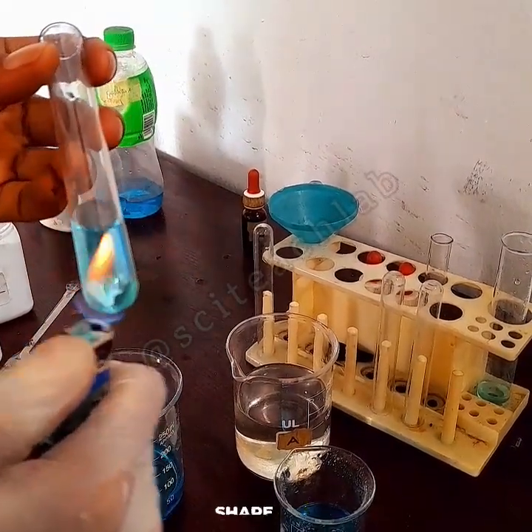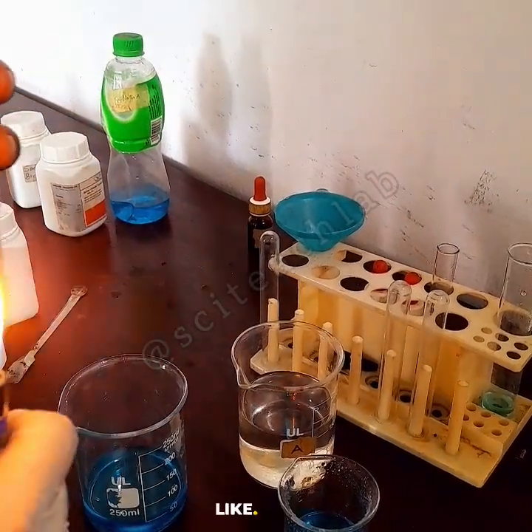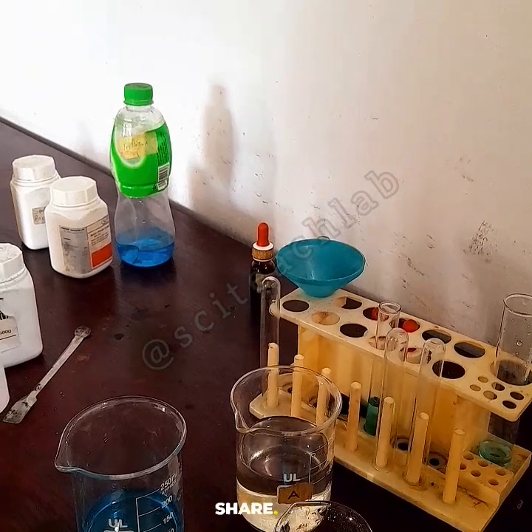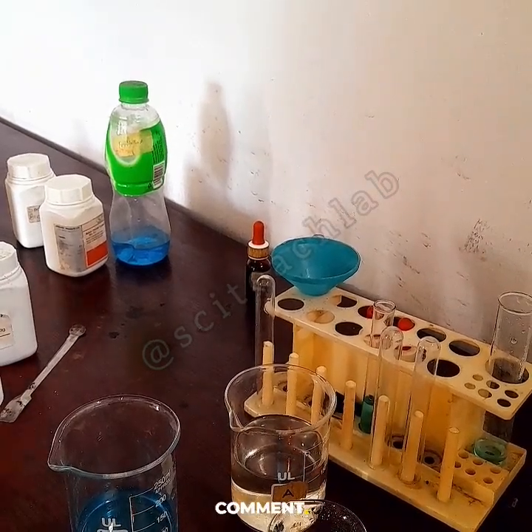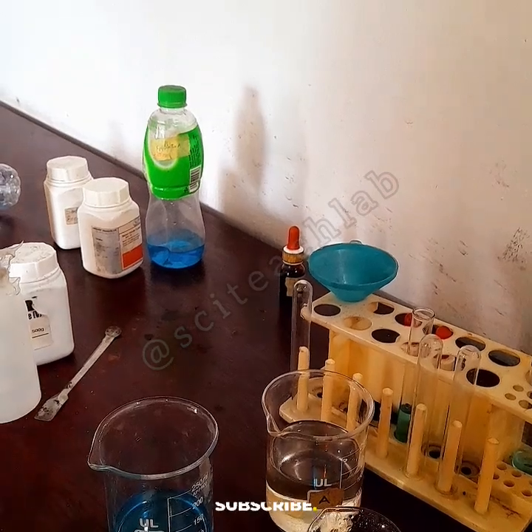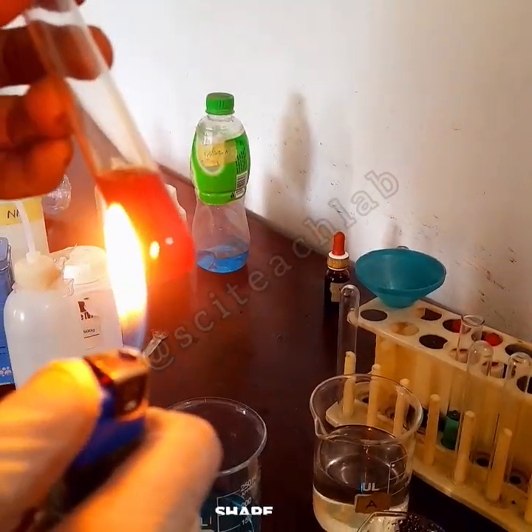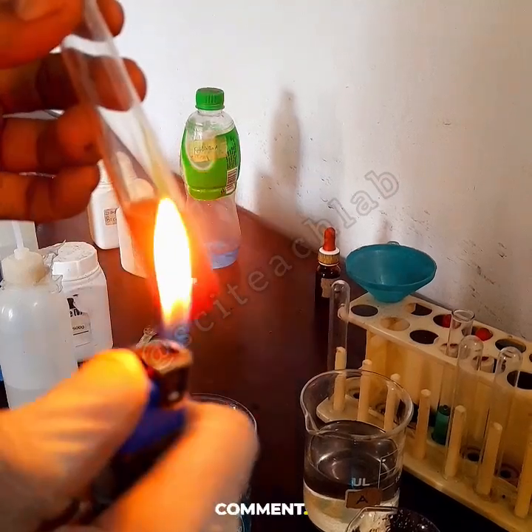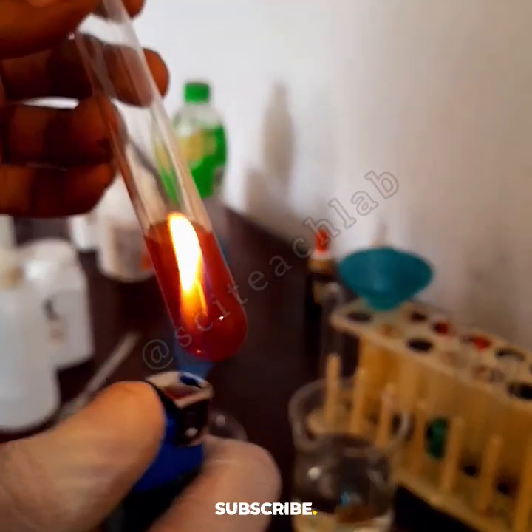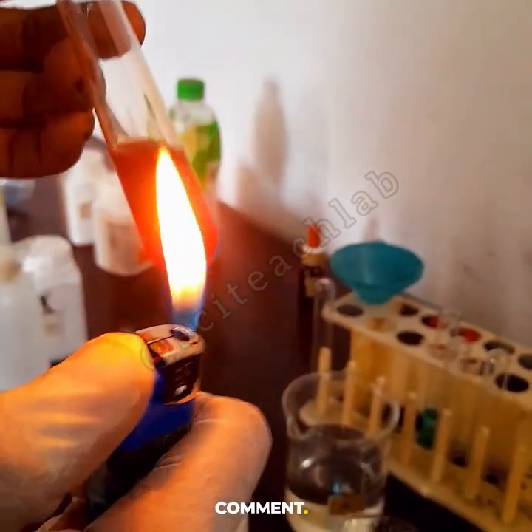If you warm it in safe conditions, I'm using a lighter now to shift it away from where my acid is, because that's the lab. So I had to shift it away from some source of what would be combustible. And what you see, with a lot of heat to warm that solution, it should turn reddish, maybe brownish, but we call this brick red.